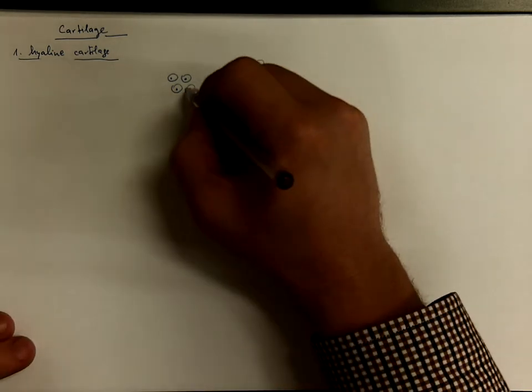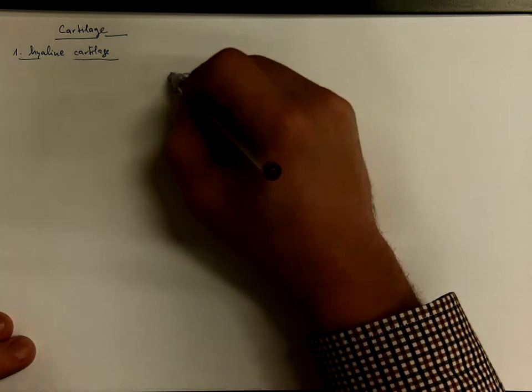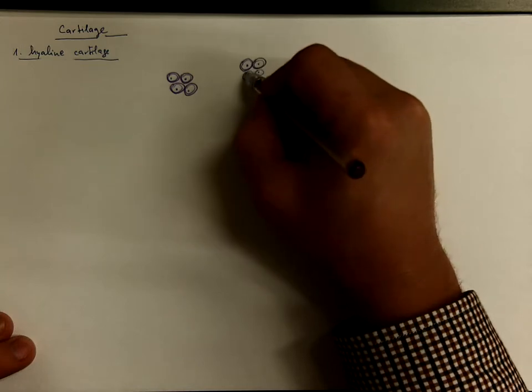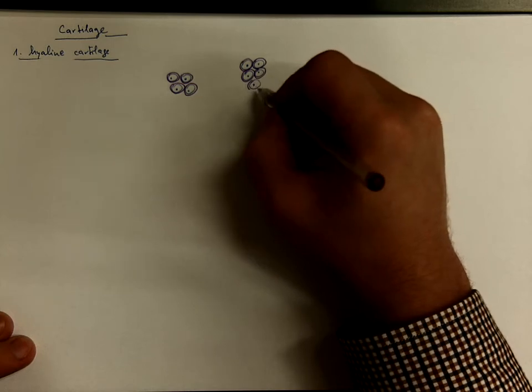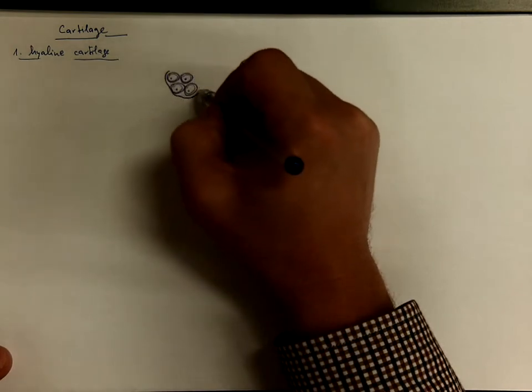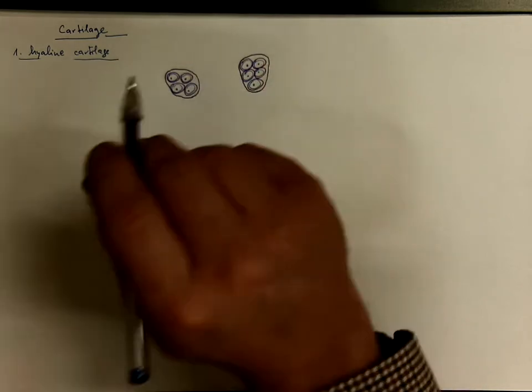and lipids. Each is surrounded by a more basophilic area of extracellular matrix. It's made of acidic glycosaminoglycans, therefore is basophilic, and this is called basophilic capsule. And the whole groups are surrounded by so-called territorial matrix because it surrounds the whole territory of this group.